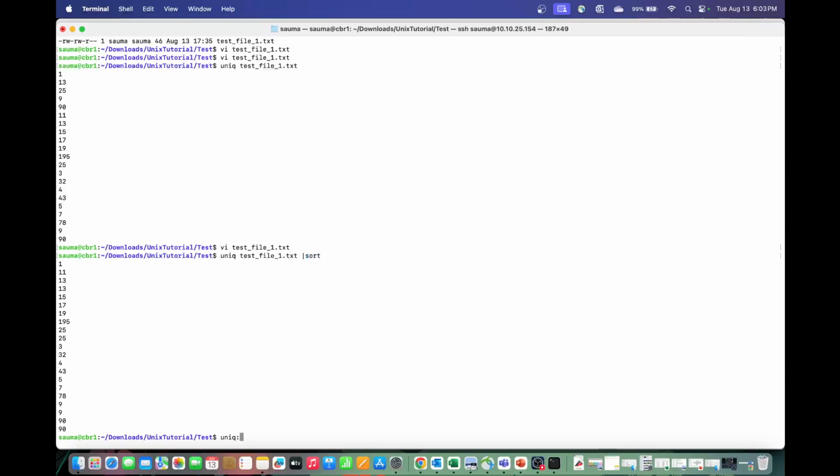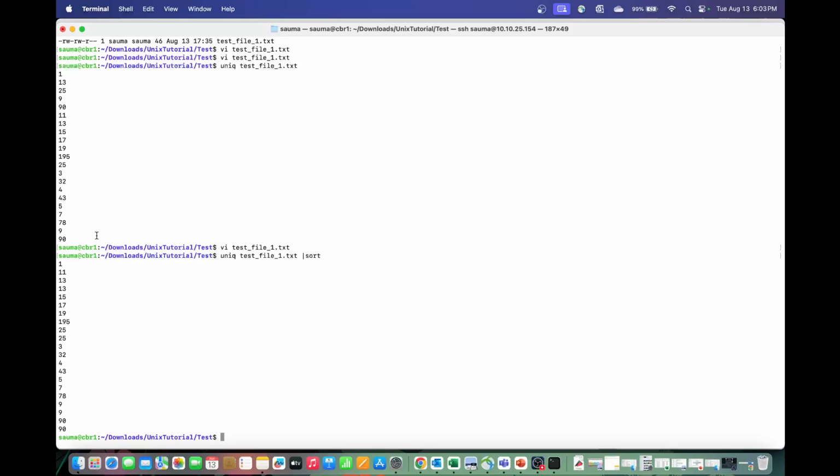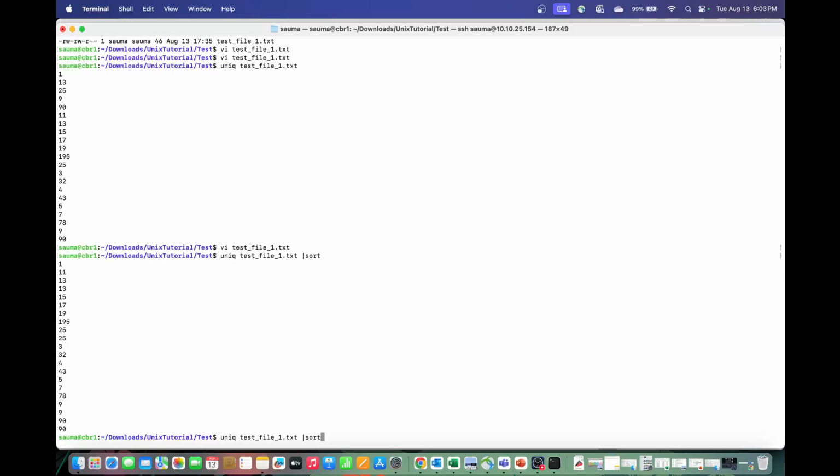So now if you see, I think first we sort and then we do this, let me try the opposite thing.